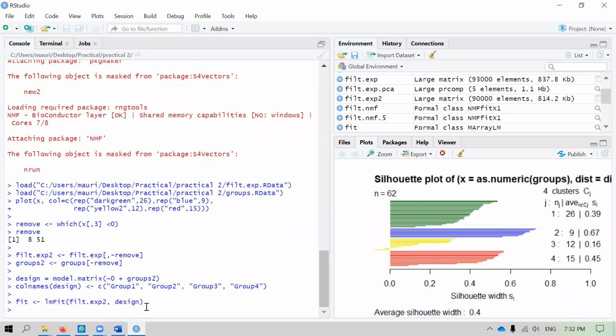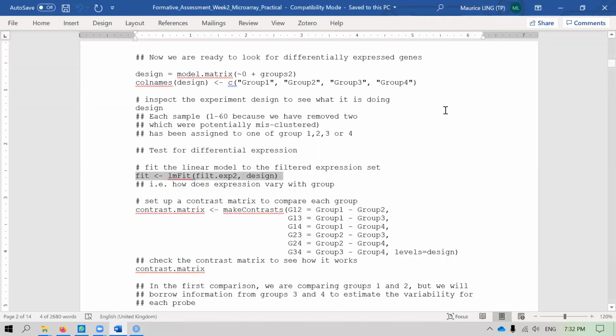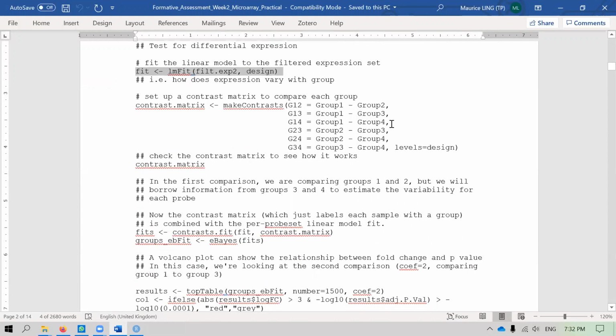Okay. So then we have this fitted data. Okay, it's just a class. There's nothing much you can do about it. So again, remember what we are doing now is a sequence of steps. So some of it may not be really obvious, unless you are familiar with R yourself. Okay. But we treat this whole practical session, or this series of practical sessions, as a recipe for you to keep doing things.